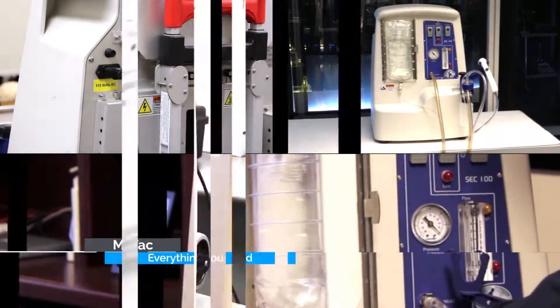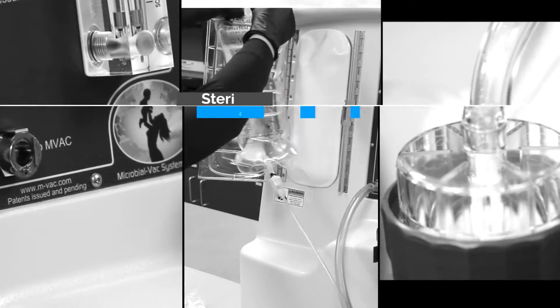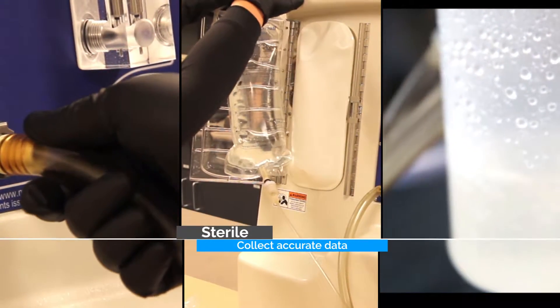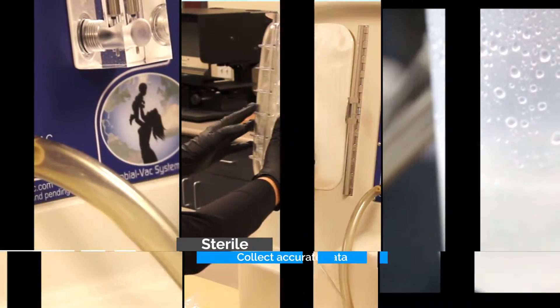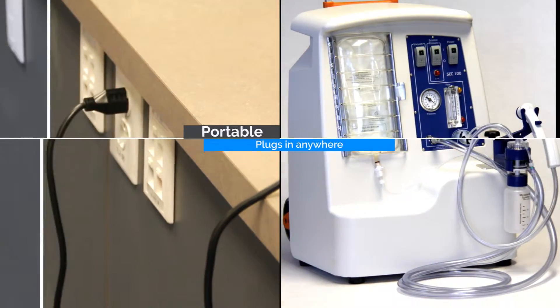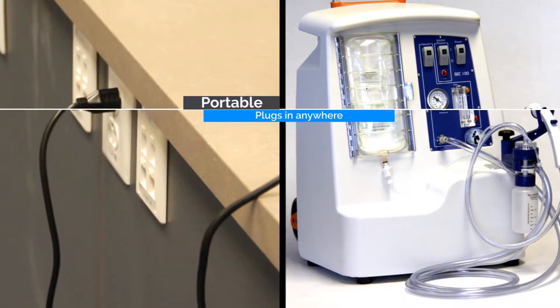There are also four sterile consumables used in collecting the DNA material. They include the MVAC, sterile solution, extension tubing, and the concentration filter. It is simple to use and sets up in minutes. It simply plugs into a standard outlet, or it can be operated with a small generator.